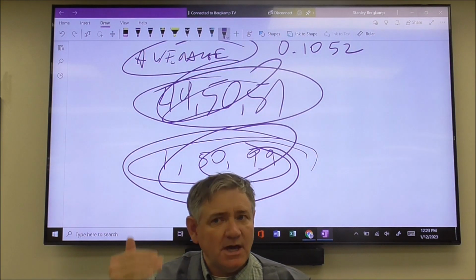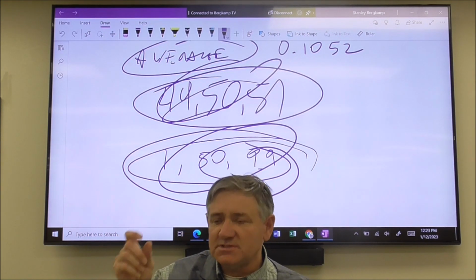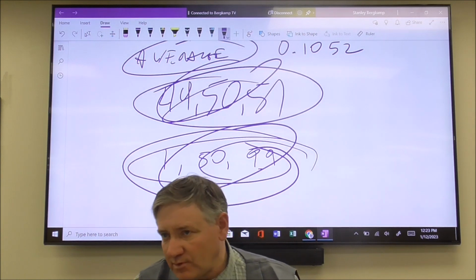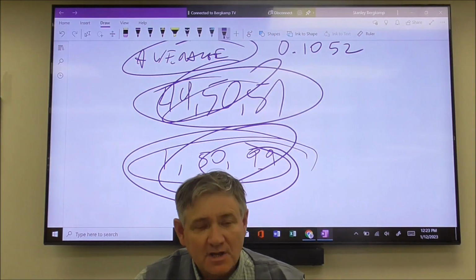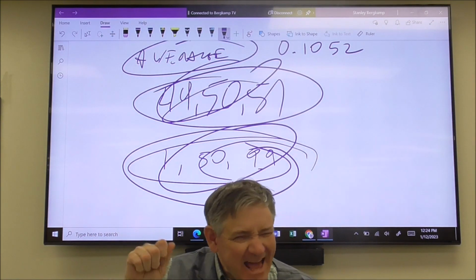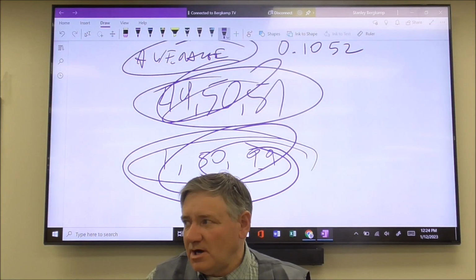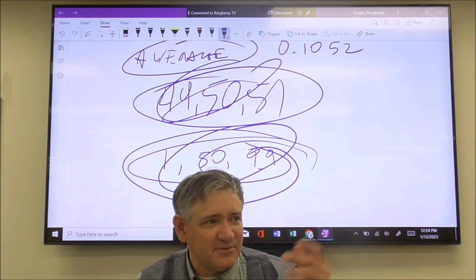And you can tell when you get close, because what will happen when you get close, that magenta color will last a little bit longer before it dissolves. That's how you can tell you're getting close to the endpoint. So when you get to that close to that endpoint, you add that last drop of sodium hydroxide, and it turns the color of Peyton's pencil case or the top of her water bottle.